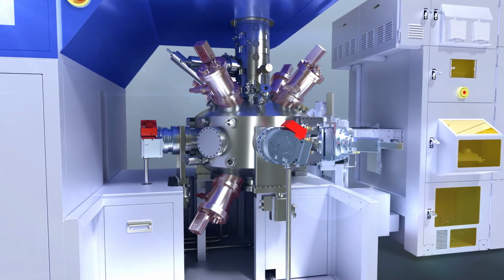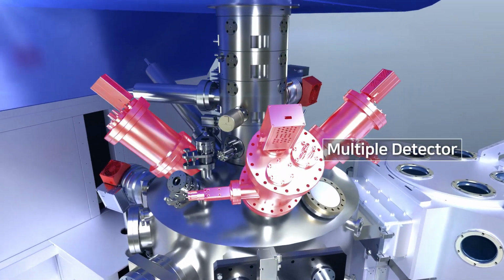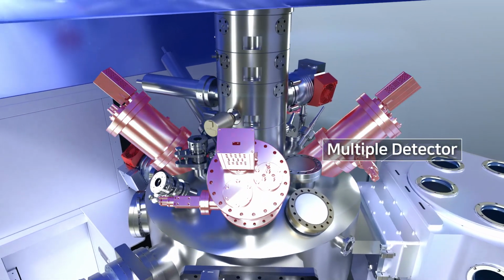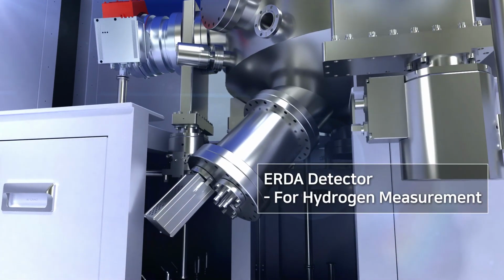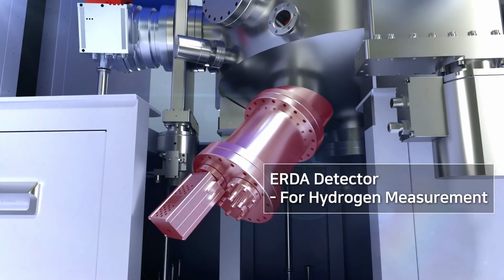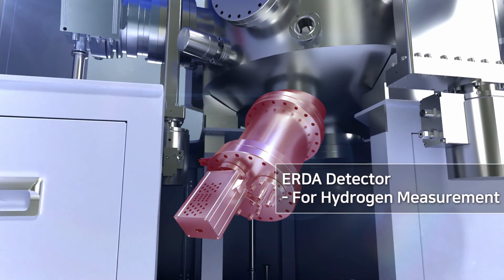TOF-MEIS uses multiple detectors. The upper detector is used to measure random or channeling spectrum with backscattering experiment. The lower detector is mainly used to measure hydrogen using elastic recoil detection analysis. In short, it is called ERDA.